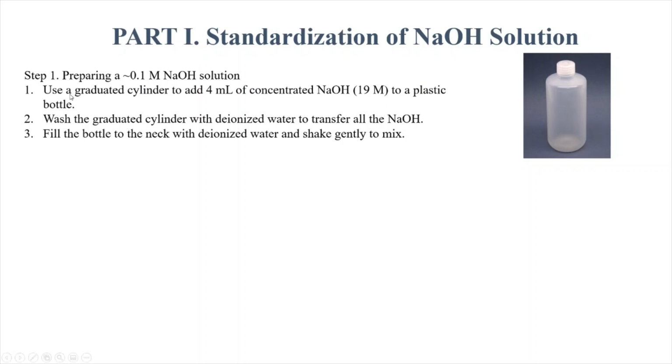So the whole purpose of all of this is, knowing that this is approximate and that we're going to dilute this to an approximate volume, we're going to have to standardize it so that we can figure out what the precise concentration of that NaOH solution is.